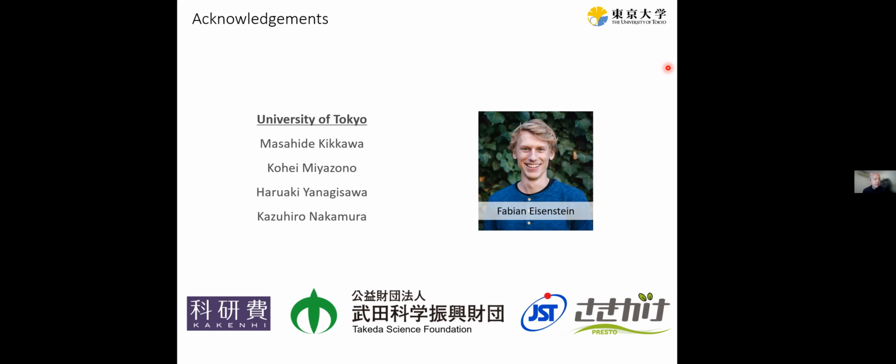Apart from this, during tilt series, if the sample is tilted and you're very close to focus, some parts of the sample may get over focused. So that's not good. There should always be some defocus applied so that no part of the sample gets over focused. In principle, you can use the over focused areas, but dealing with them in practice may be a bit difficult. I haven't done tomography in these conditions, so I don't have experience, but I've heard from people that you shouldn't go over focus.